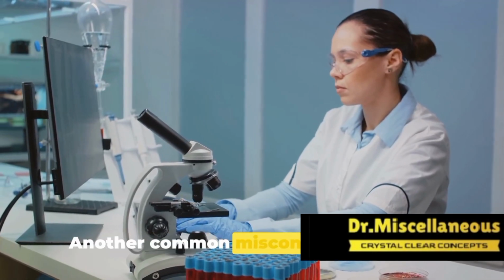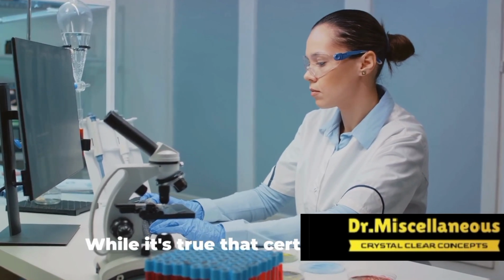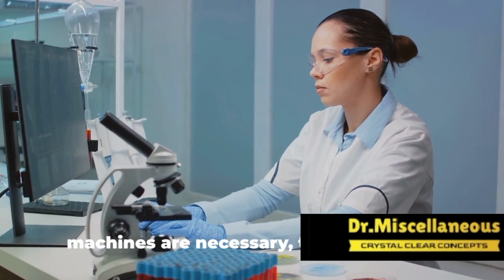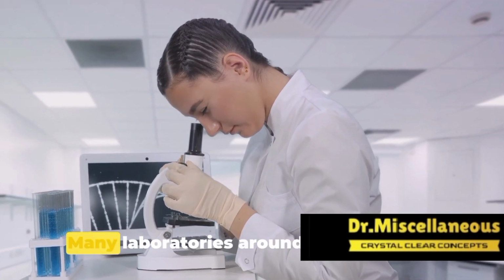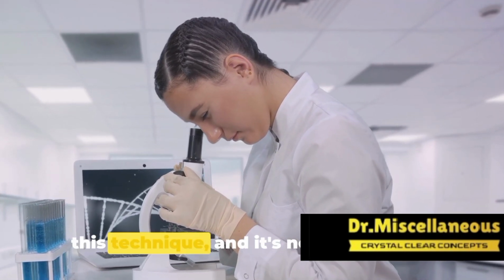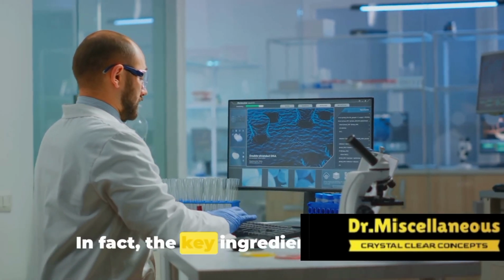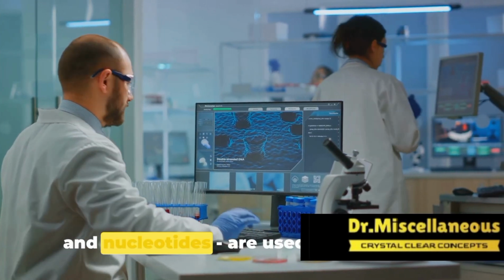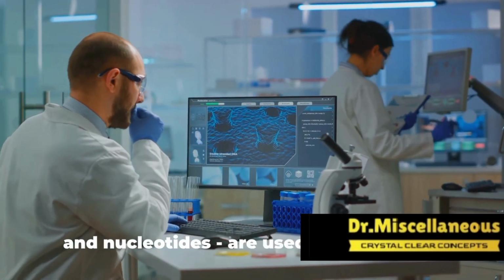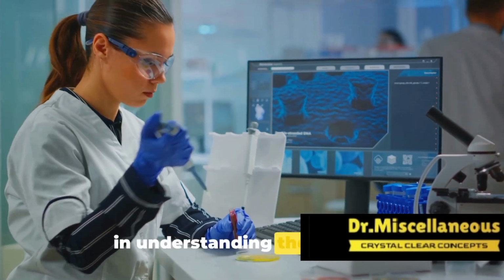Another common misconception is that Sanger DNA sequencing requires expensive, high-tech equipment. While it's true that certain tools and machines are necessary, they are not as out of reach as you might think. Many laboratories around the world use this technique, and it's not exclusive to high-budget facilities. In fact, the key ingredients for Sanger sequencing, the DNA polymerase, primers, and nucleotides, are used in many other biological procedures as well. Now let's talk about some difficulties in understanding the process.